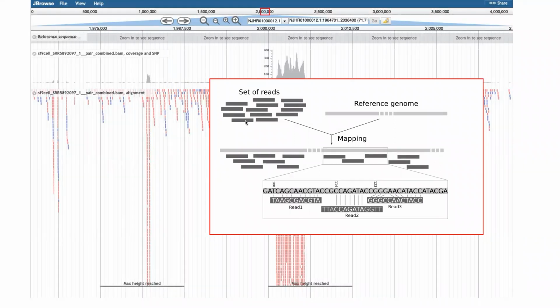And the set of reads that we originally have, this is shotgun sequencing or amplicon sequencing, it doesn't matter. We only have a small portion of reads, or actually a large portion of reads. So we have a lot of short sequences. And the goal is to understand, where do they map? So if you imagine, in this case, we used one single genome as a reference. We can, in the same way, organize all of the 16S genes one after the other and just use it as a reference genome and look, where do our reads fall? Where do they align well?